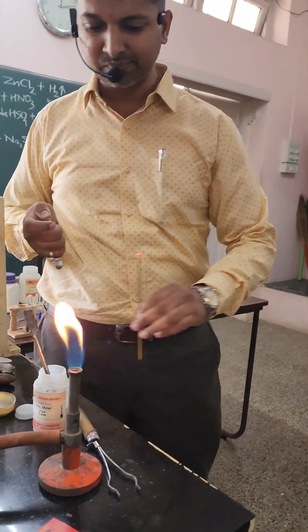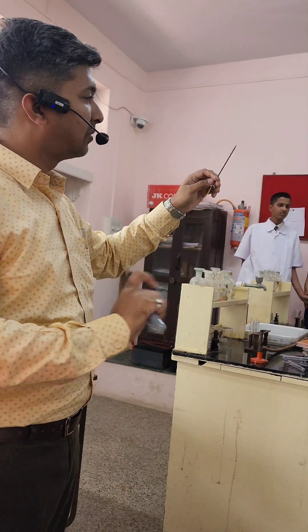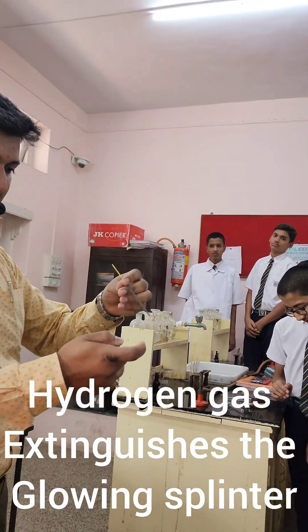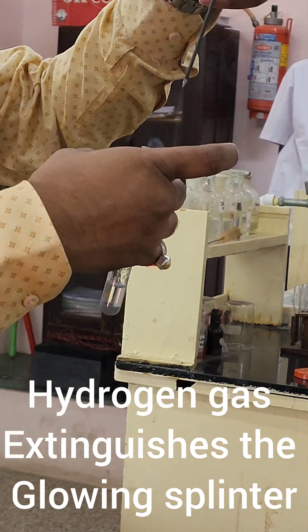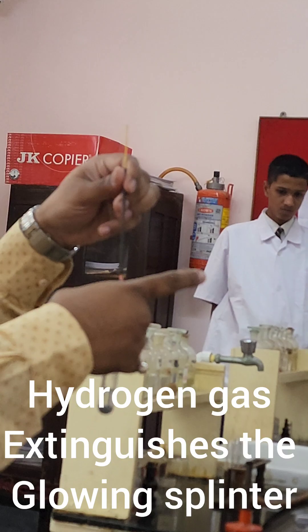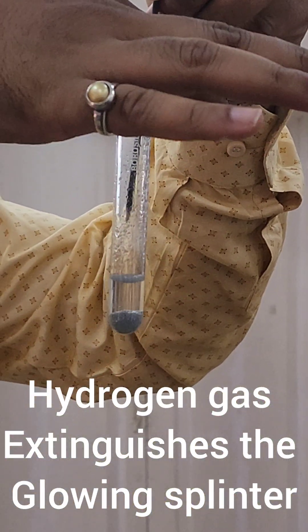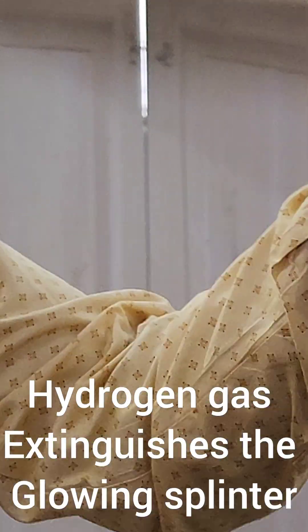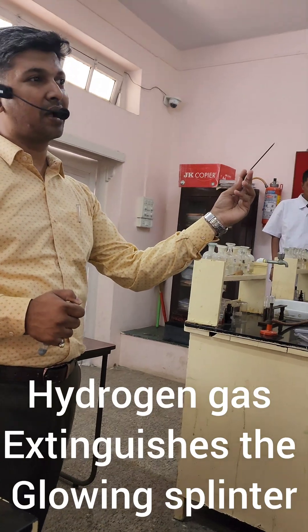So what I will do is take the incense stick and immediately you will feel the pressure against my thumb. Can you see the incense stick got extinguished? When I take it out, it will again start glowing, but when I put it inside, you will see that it is getting extinguished. See, now it has got completely extinguished — why? Because of hydrogen gas.